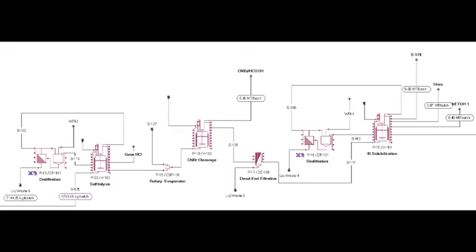Operation Unit 17: Dead End Filtration DE101. All remaining fine particles like biomass, debris, and inclusion bodies are removed using a polishing dead end filter to protect the chromatographic units, and the solution volume is around 2100 liters.